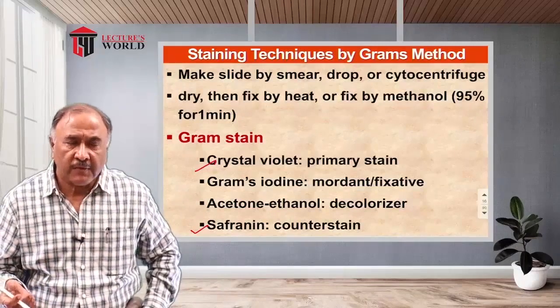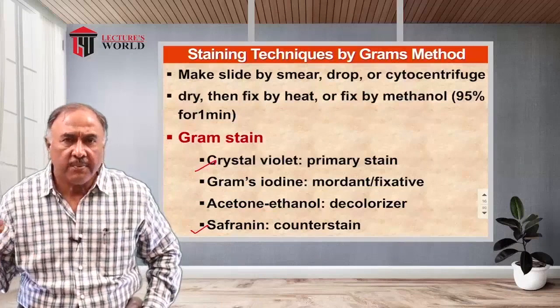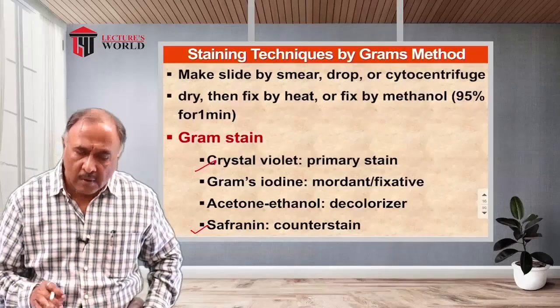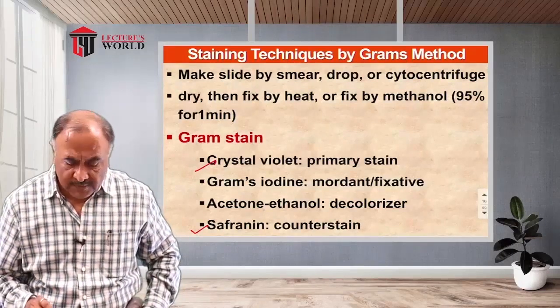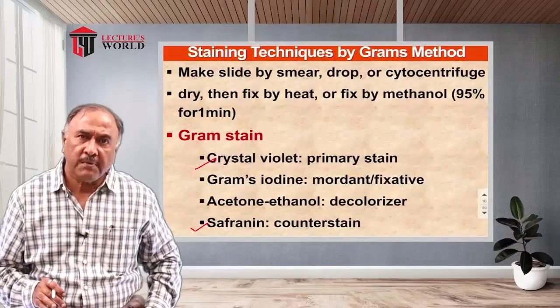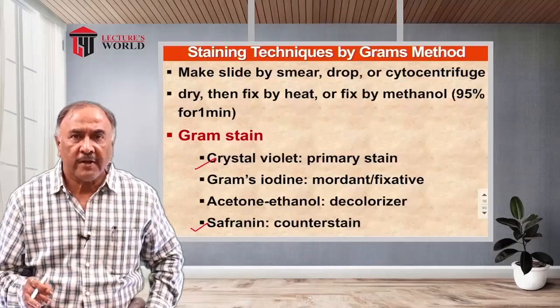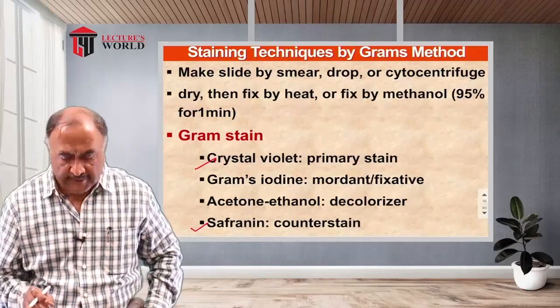Now these staining techniques used by different technicians basically follow a single line of procedure. Most, or I would say all of them, first start with the Gram staining technique. Gram staining is a basic technique used in microbiology labs for differentiating organisms into gram positive and gram negative ones.